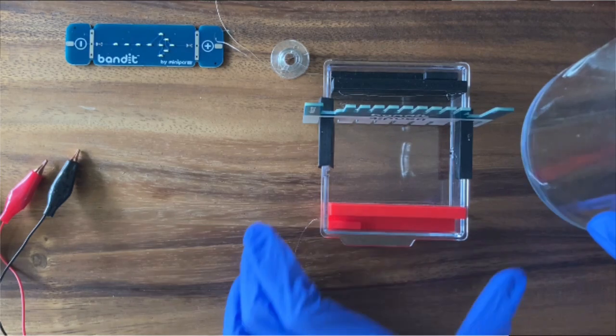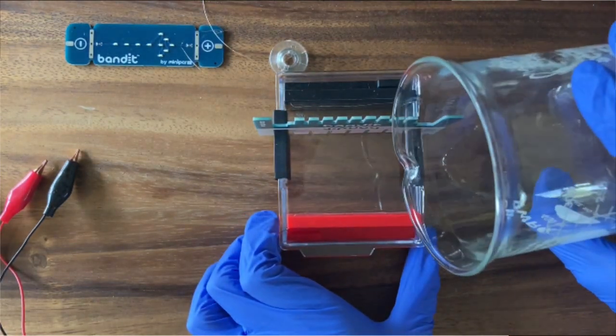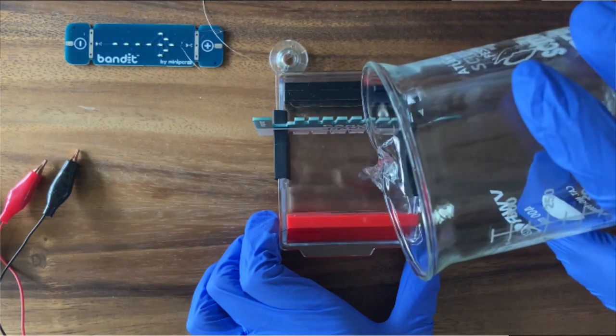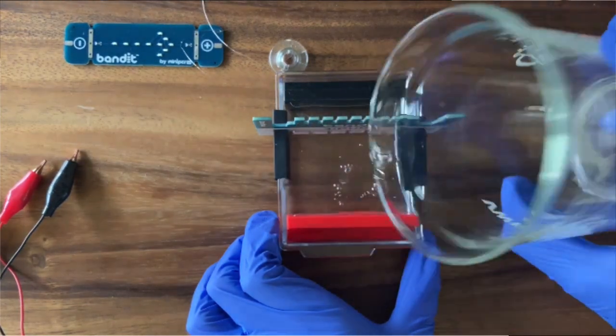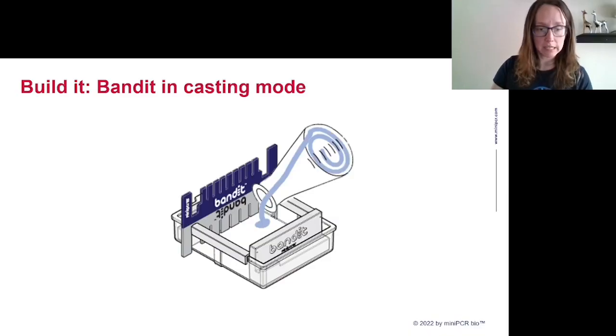The only thing left to do now is pour in the melted agarose that we're going to use to make our gel. Here's my agarose. I'm pouring in 30 milliliters. It's the amount of agarose that a Bandit gel takes. And it'll take about 10 minutes for it to firm up and harden.